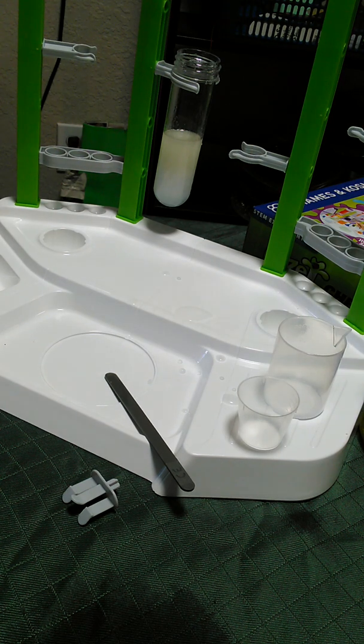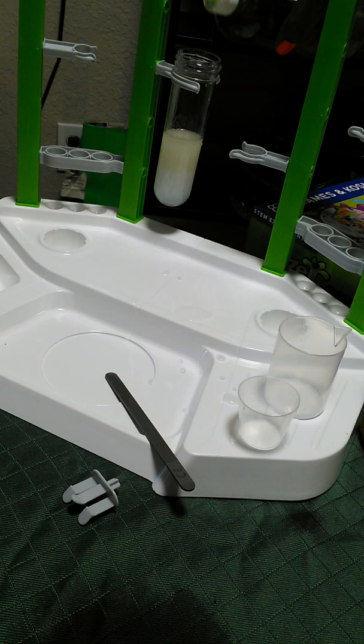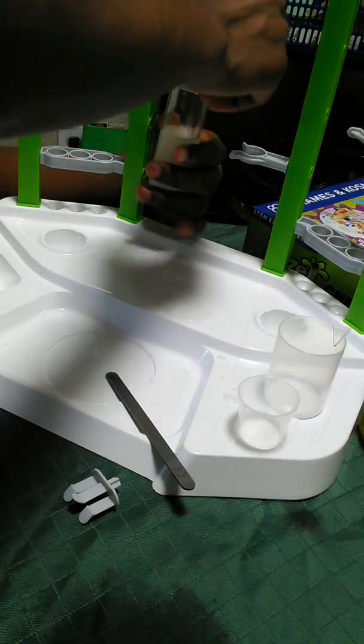So it's a few drops, about 4. 1, 2, 3, 4. So put the top on. I'll shake it this time.